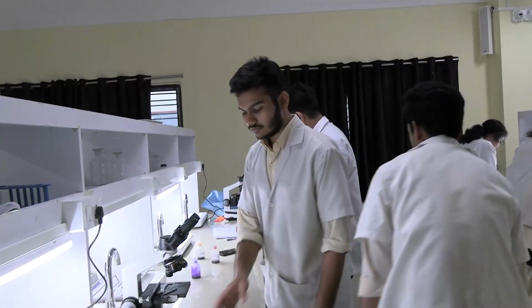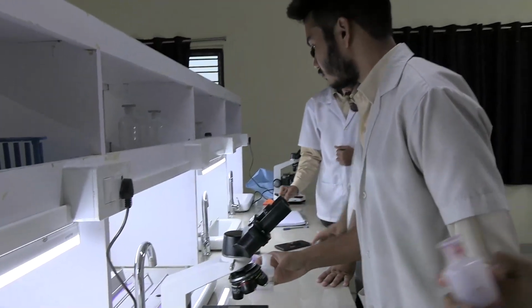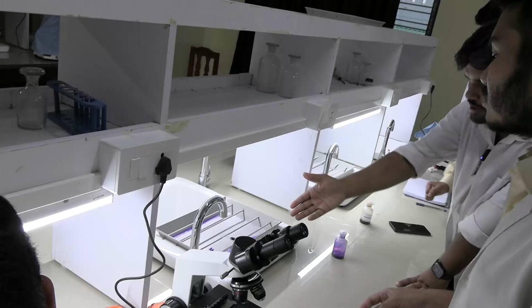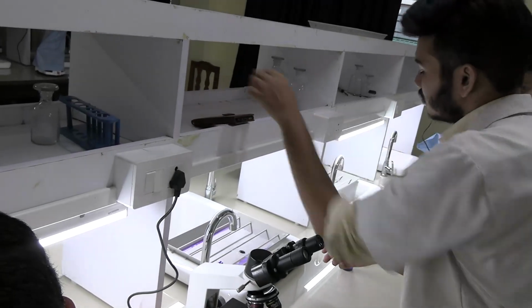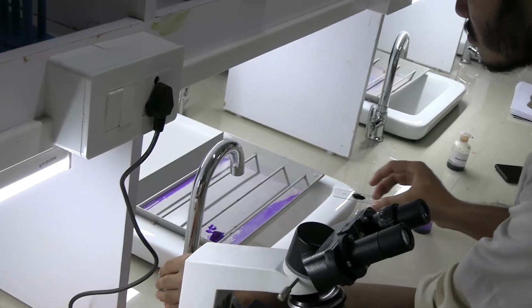Have you placed the Mordant? No, sir. Yes, sir. Okay, Mordant. Now you're gonna do the decolorizer. You have to wash it away now first. Have you washed it? So wash it away. Okay. Is your time over? So you're gonna wash it. Just as I told you. Okay. Now your step is the decolorization.